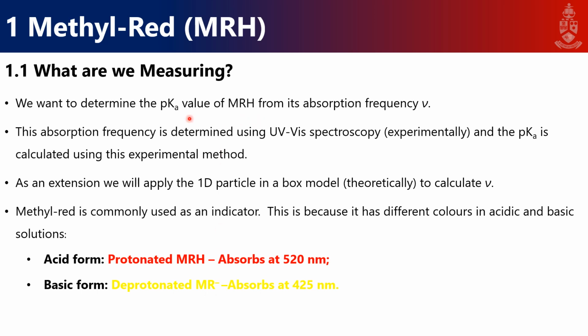And we will determine this pKa value from its absorption frequency, given the symbol nu, and of course nu and the wavelength at which it absorbs have a specific correlation, which you can easily calculate from. We will determine this absorption frequency from UV-vis spectroscopy, so that's our experimental way.